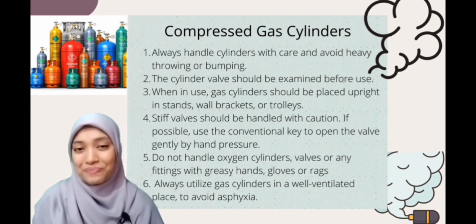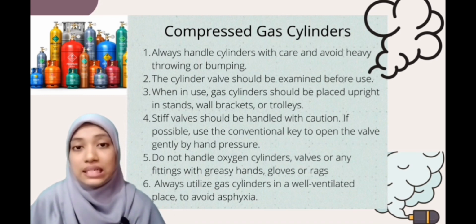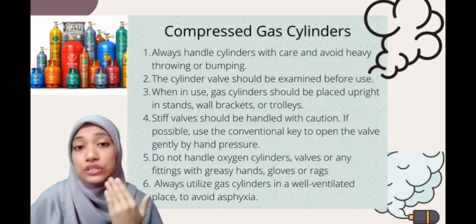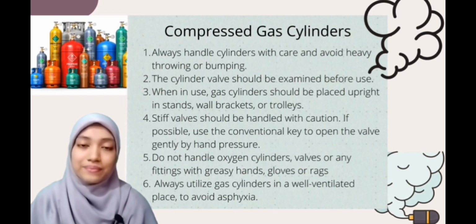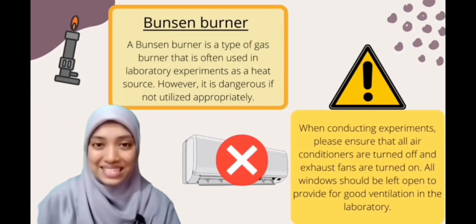What is asphyxia? Okay, asphyxia is a condition when the body does not receive enough oxygen and then affects our regular breathing that may cause unconsciousness and may even result in death. Next, I am going to talk about Bunsen burner.